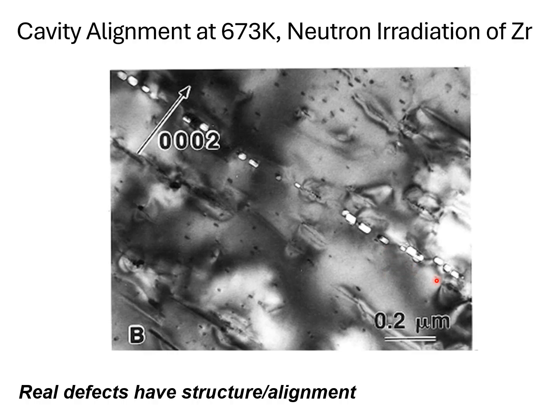And it's probably likely that that's because there are some impurities here that not only affect the C-component loops, but also the cavities. In that particular case, it's probably likely that you've got some nickel close by, and some boron, and you've got some helium generated to stabilize these cavities.